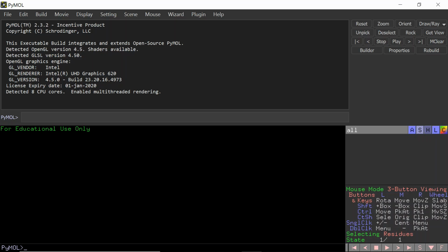Now we will apply some of what we learned in the user interface section to make a visualization of a structure called 1EMA, a green fluorescent protein. Biomolecules like this exist in the real world as 3D entities. Scientists can capture a 3D model of these entities and export them to a digital format. In this case, we're using a Protein Data Bank file, otherwise referred to as a PDB. There are a couple of different formats that PyMOL can take, but PDB is by far one of the most common.